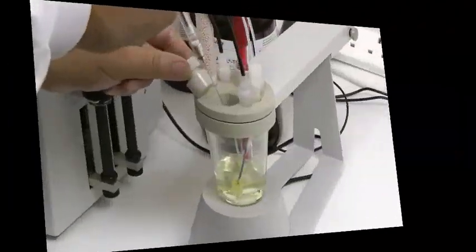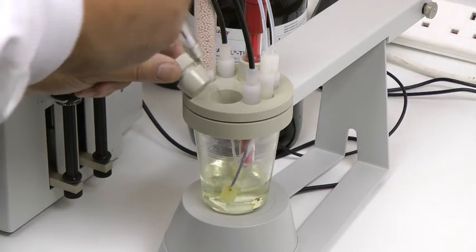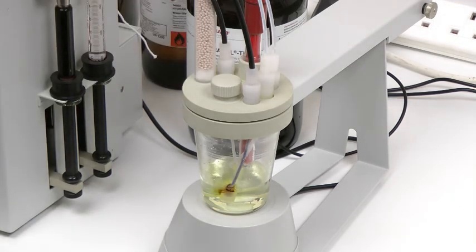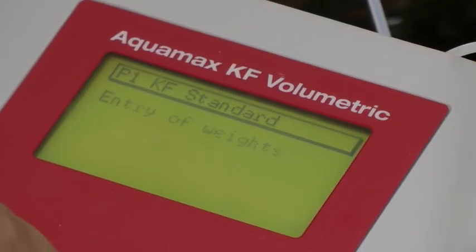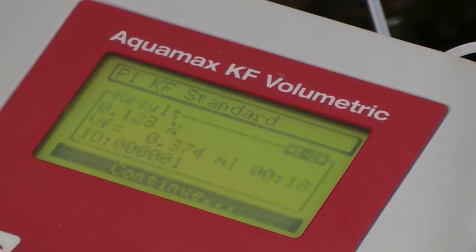Once the system has standardised and the standardisation factor has been accepted, the sample is ready to be inserted into the vessel and the titration started. The weight of the sample is input through the keypad, and the Aquamax KF Volumetric gives a percentage result of water in the sample.